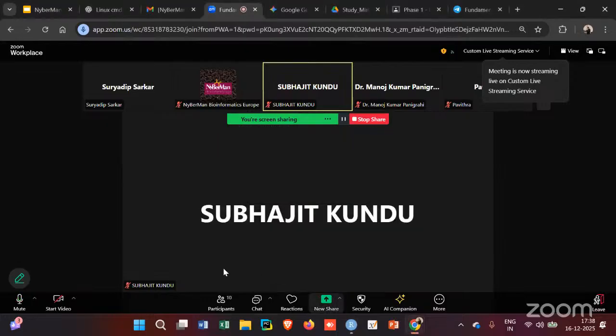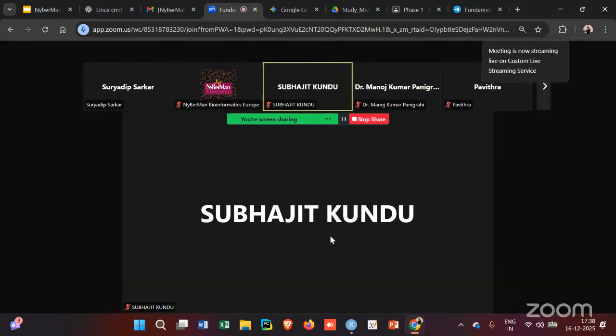So everybody is good on this. People have downloaded and installed R and RStudio. Give me a thumbs up if you have. Okay, one person. What about the others? Okay, very good. Okay then, let us begin. For those of you who have not, no problem. As I said, just follow the lecture. You will have access to the recordings. So practice it whenever you can.